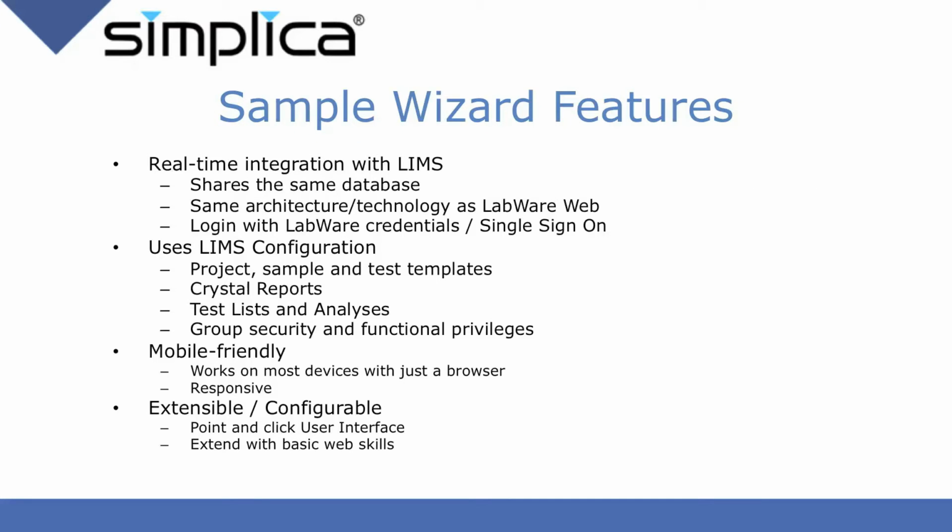Let's take a look at the Sample Wizard features. We have real-time integration with LIMS. This is possible because Sample Wizard shares the same database as LIMS. Sample Wizard uses the same architecture and technology as the Labware web products, so we're able to interface directly to the core Labware APIs. Sample Wizard can be configured to use Labware credentials so users can log in with their existing Labware accounts or bypass login altogether with single sign-on.